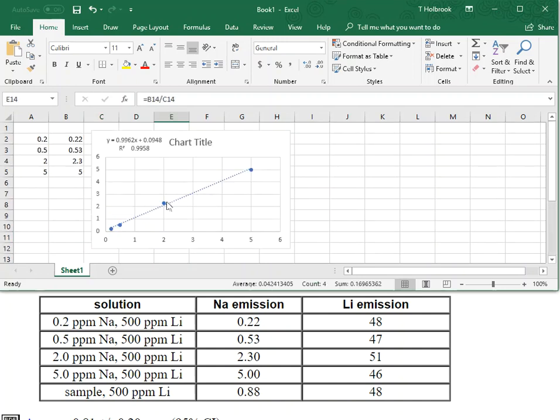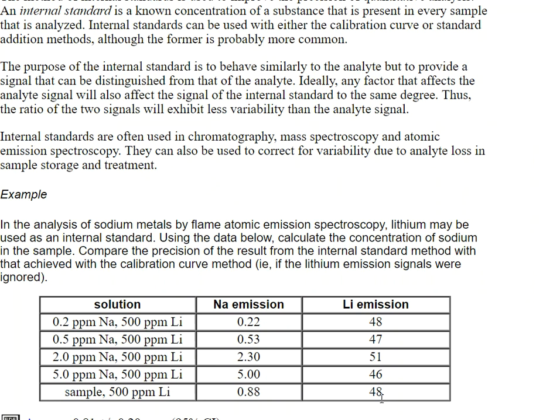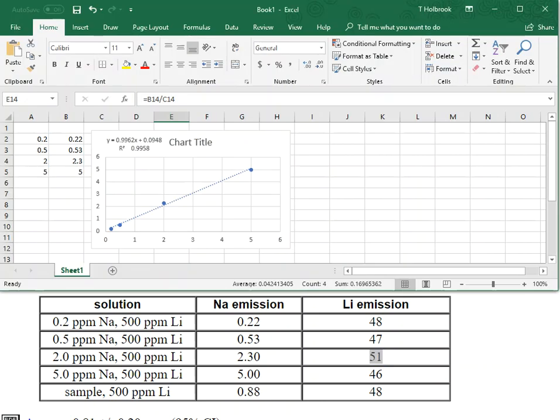Remember what we said? We said, hey, number 3 looks like it's a little wonky. But look down here. Out of all of the internal standards, we said these numbers should be constant all the way through, right? This one was the greatest, number 3. So maybe it wasn't me that messed up the standard prep. Maybe the machine just accidentally injected a little bit too much on standard number 3, and the internal standard tattled on it. It let me know what happened in that analysis.